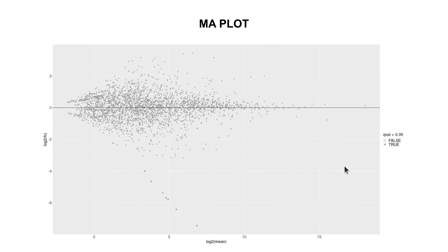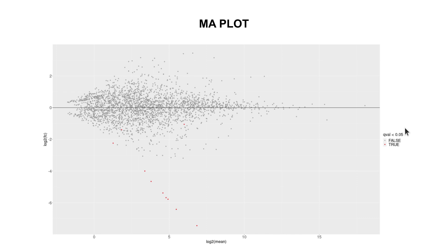Let's look at the next figure: MA plots. MA plots are also two-dimensional scatter plots used to visualize gene expression data and identify changes in gene expression between two conditions. On the x-axis we have the log2 of the means of the normalized read counts, and on the y-axis we have the log2 fold changes. A q-value less than 0.05 indicates differentially expressed genes.